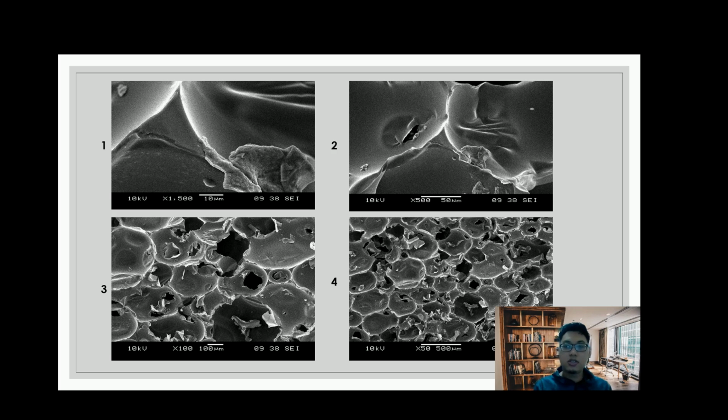To use SEM, the sample needs to be cut into small pieces to fit into the chamber. However, improper cutting technique makes the surface of the sample damaged. From the image obtained, we can conclude that the cells have an almost spherical and round shape.